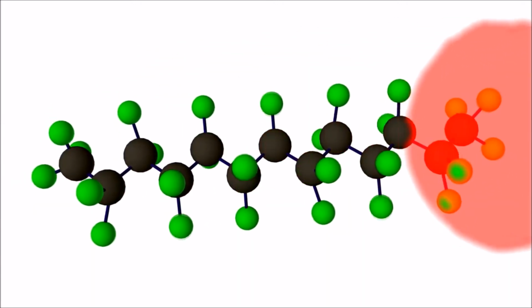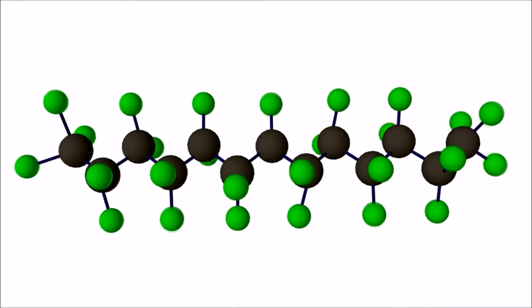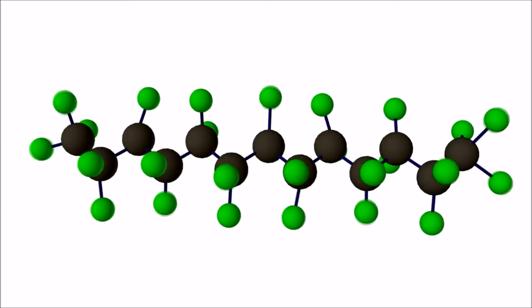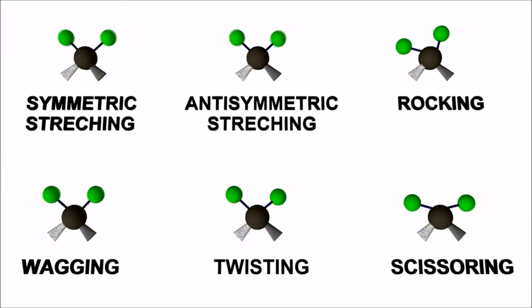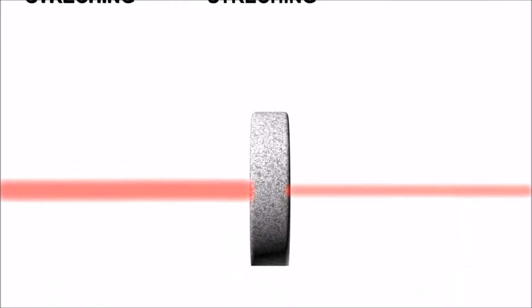Namely, if the exciting electromagnetic radiation has a specific amount of energy, then it can be transferred to a molecule and cause it to vibrate in a unique way. Note that a different wavelength exciting radiation is required to initiate each of these vibrations.